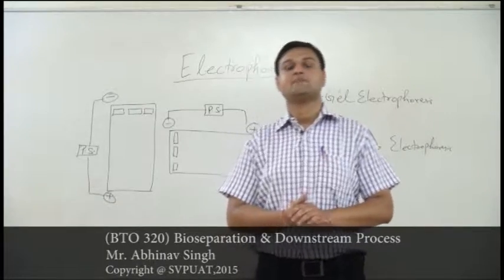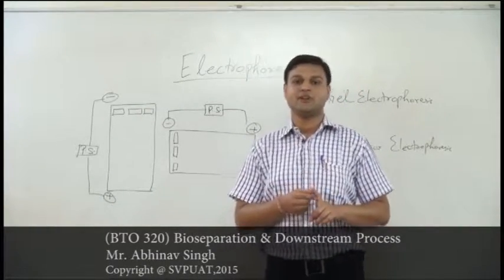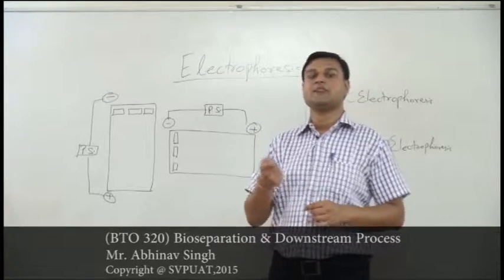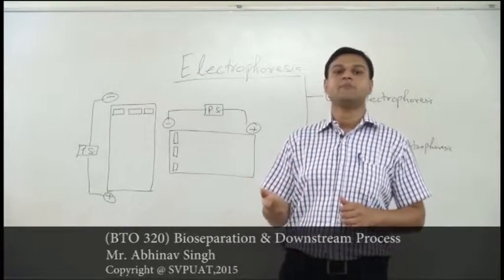The particles are basically separated on the basis of their size, their shape, their molecular mass, and very importantly on the basis of their charge, the charge that is present over the particles which are to be separated from the rest of the materials.